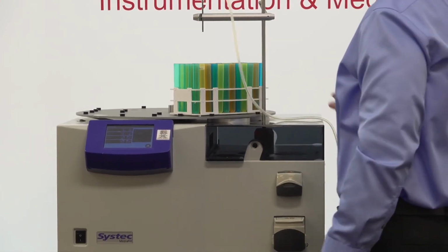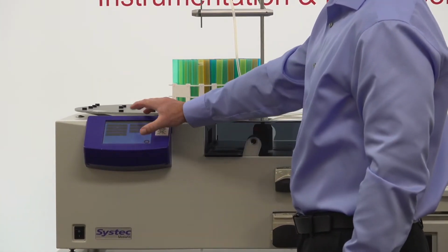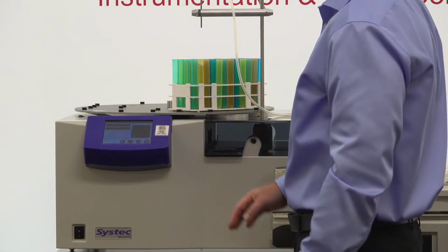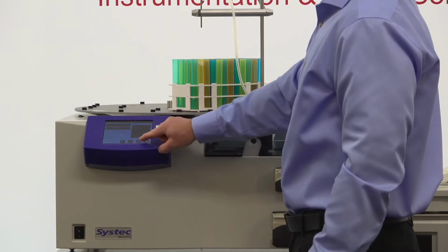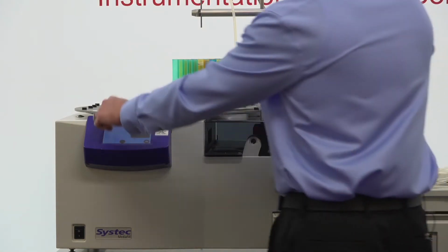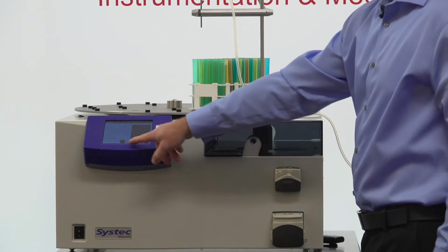So once this goes into position, we can go through the tube filling, and again, we will go in through the screen later. Go to tube filling. That's the one that we want. And we just move the arm to a position that states on the screen.